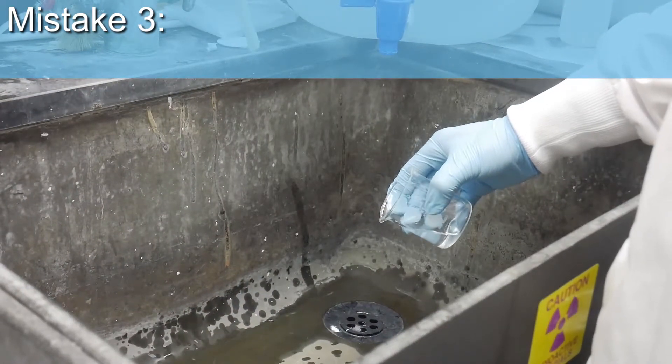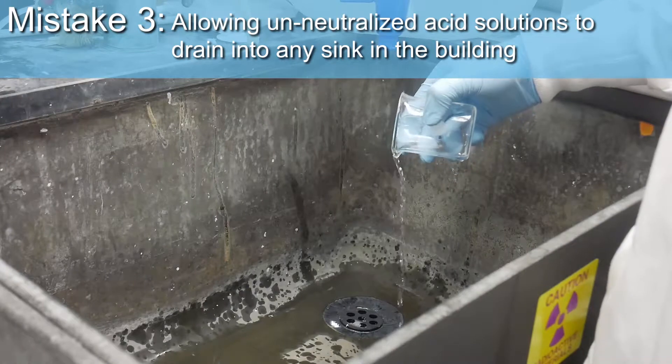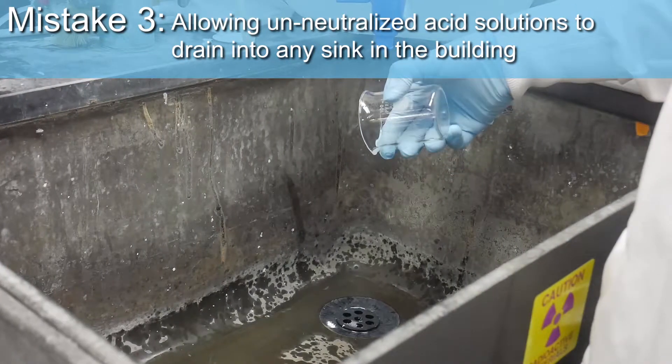Mistake 3: allowing unneutralized acid solutions to drain into any sink in the building.